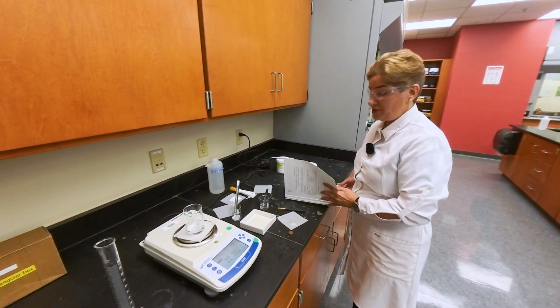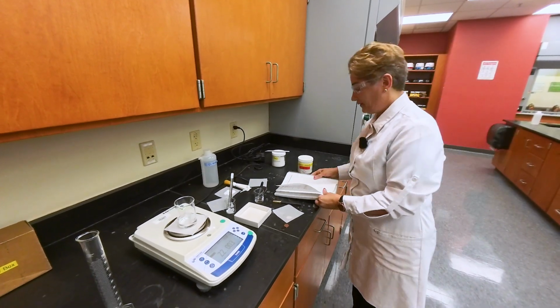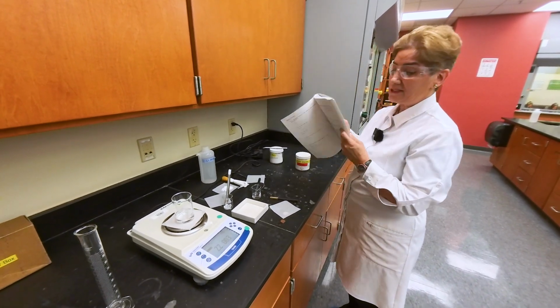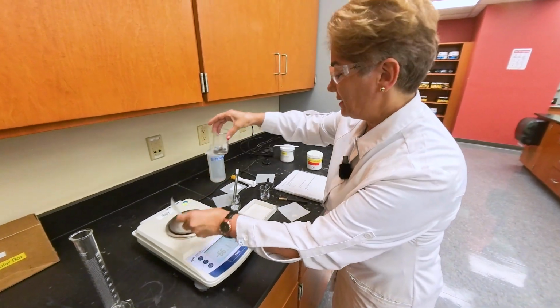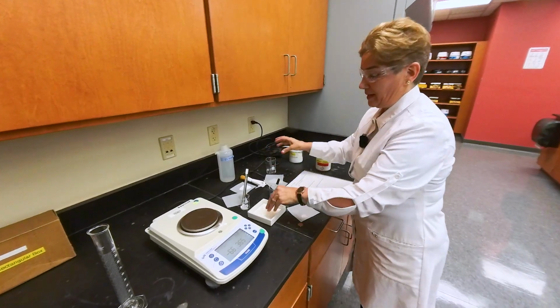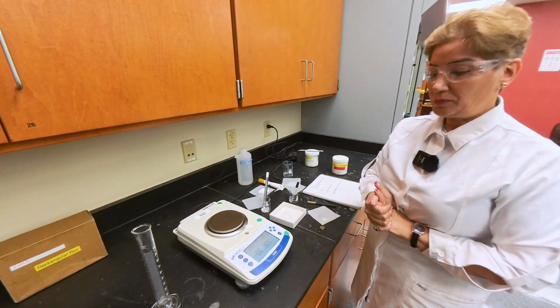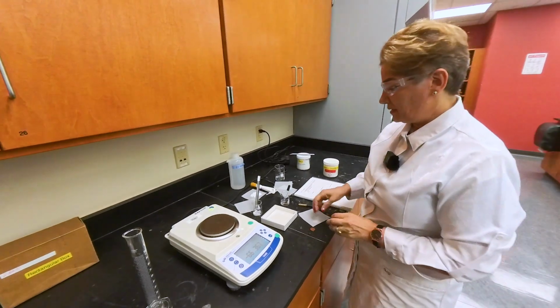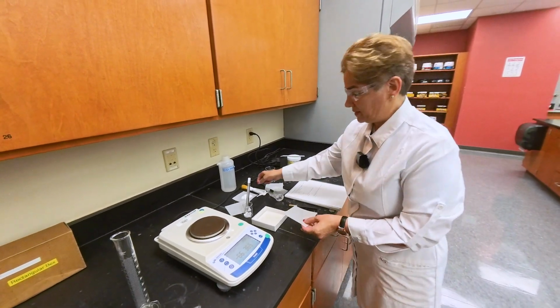Next type of measurement is measuring by difference. In this type of measurement, we do have and need the mass of an object by difference. That means the mass of the container subtracted from the mass of the container plus the sample.